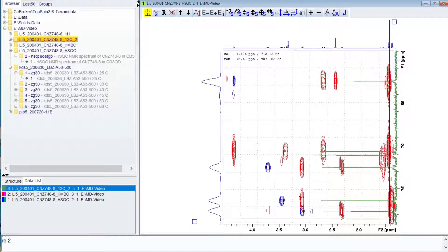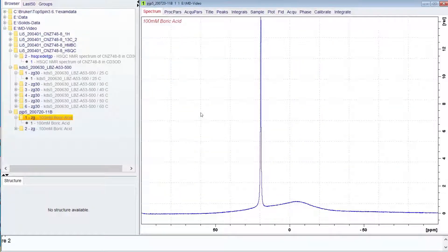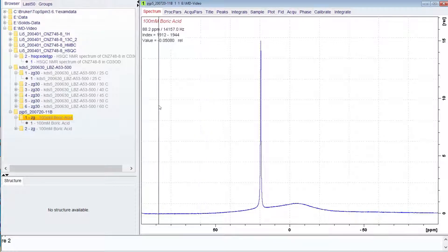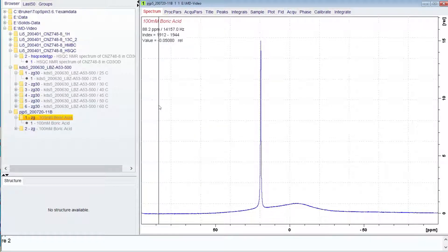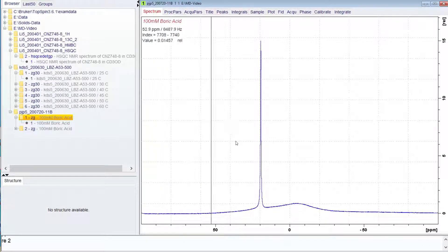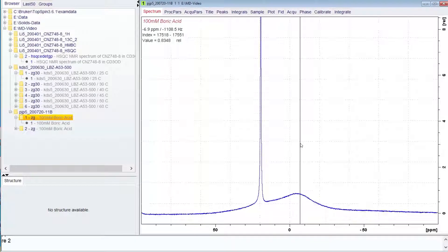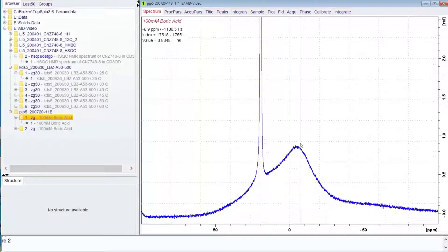The last function for multi-display mode is spectrum addition and subtraction. This can be useful for spectra with significant background signals. This is a boron-11 spectrum of boric acid.